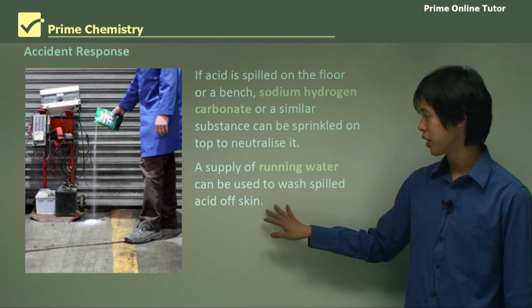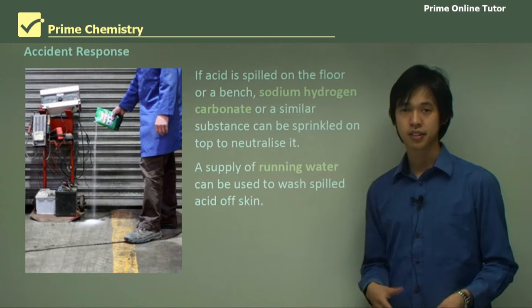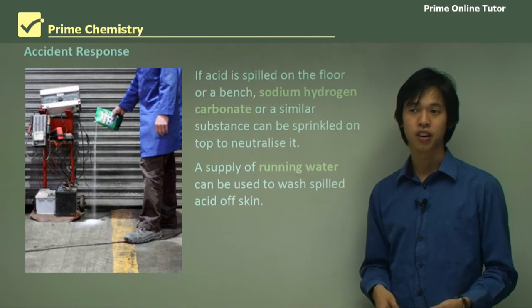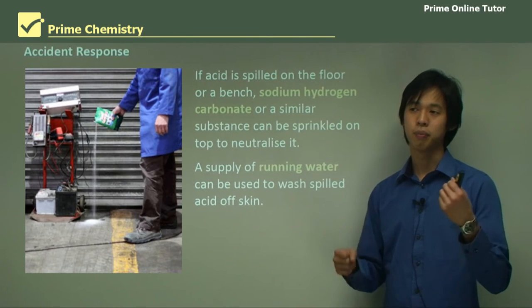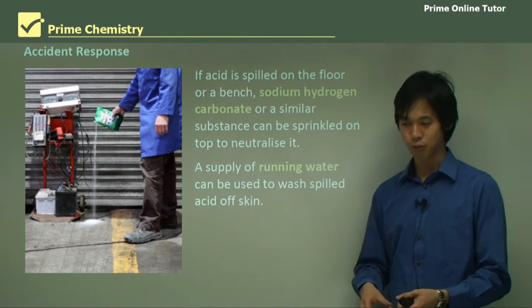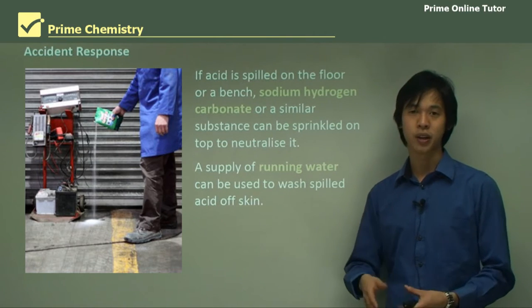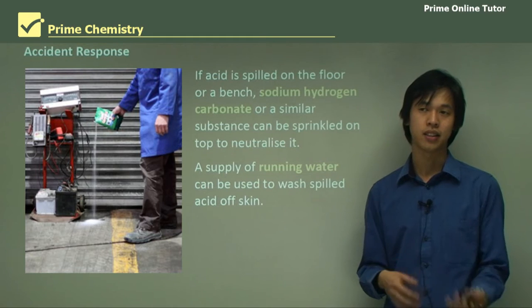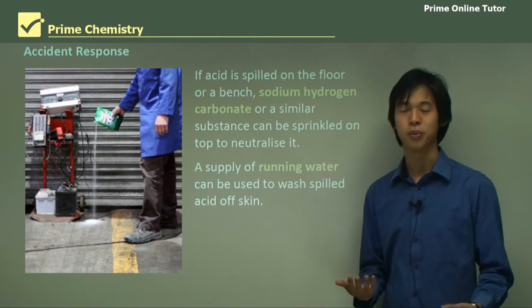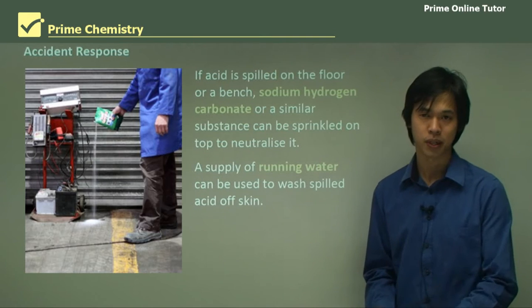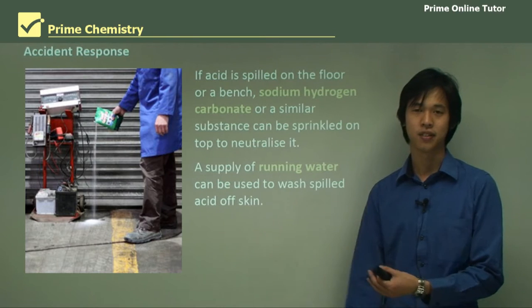A supply of running water can be used to wash off acid that's been spilled on your skin. When you spill acid on your skin, wash it straight off — otherwise it will burn you, and it will also release a lot of heat from drawing water out of your skin. A big supply of running water not only washes away the acid, it can move the heat away as well — similar to how when you burn yourself on a Bunsen burner you put it immediately under cold water to get all of that heat out.